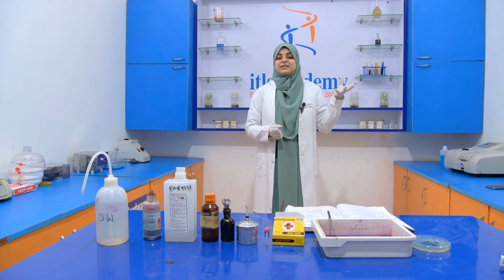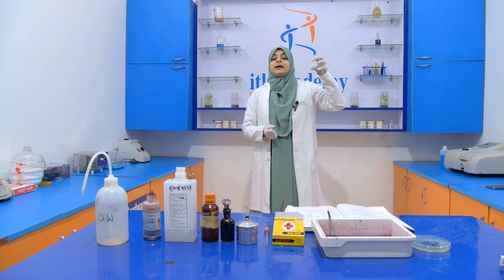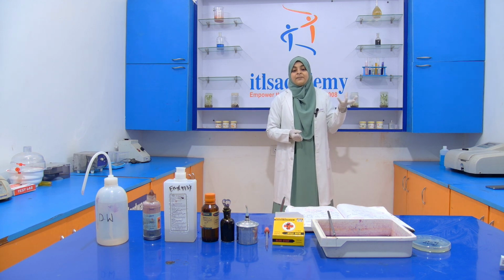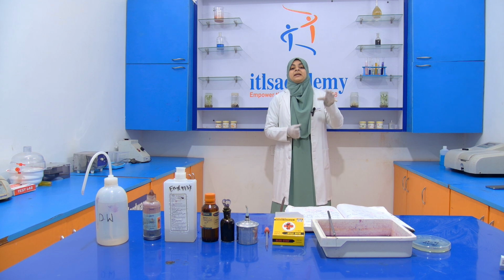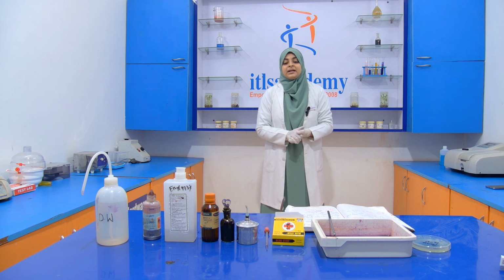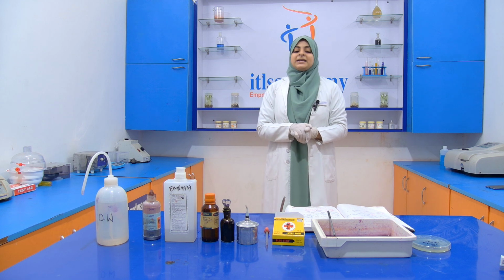That's why we do staining, because it highlights that area of the bacterial cell and also adds color to the bacterial cell. That is called staining.